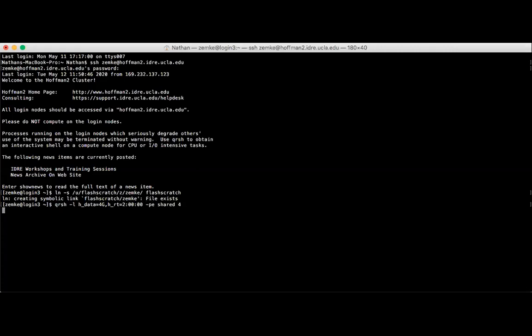Hopefully it won't take very long to do that. No, it should be fine. You'll know when your session got granted because your login, your username will no longer say your username at login. It'll have some numbers, which is the session number that was designated.